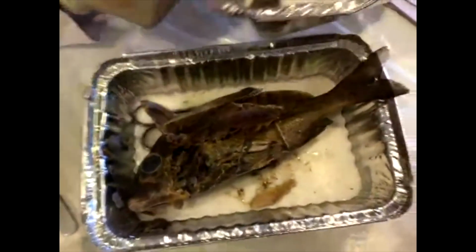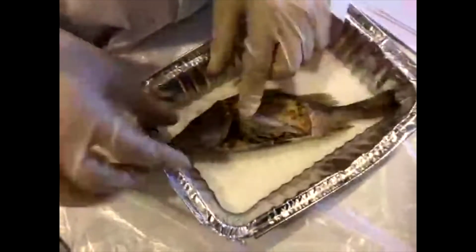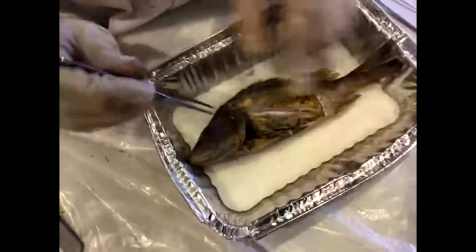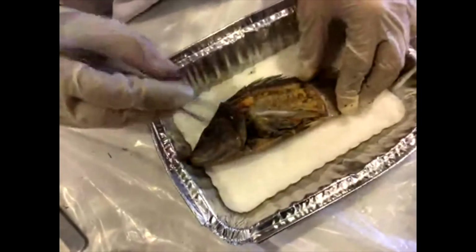And I'm just going to switch our fish for a second to see if I can get the heart out of this one. So this is a fish that I had a practice on earlier. And we're going to go through and just remember the different pieces. See, I didn't take the operculum off this one, so we might be able to get the heart here.